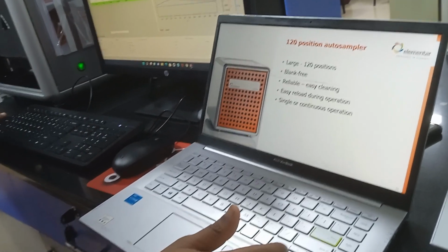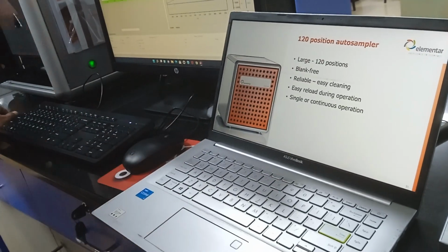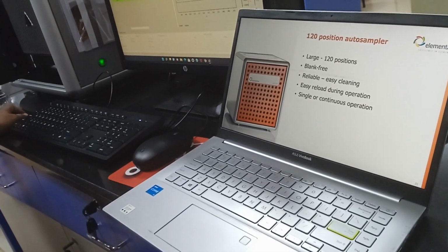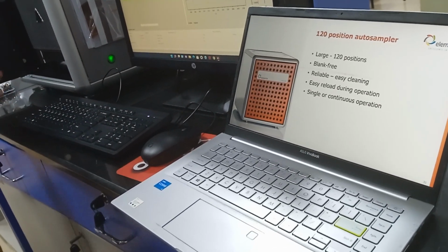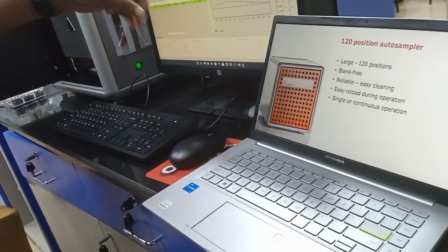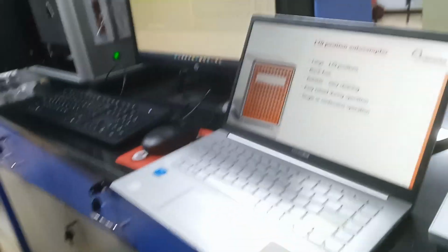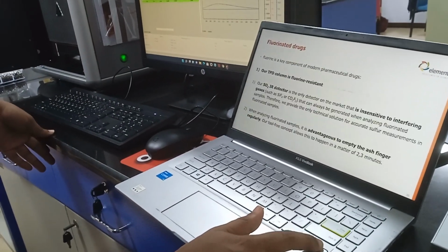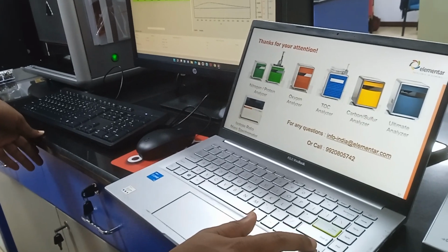It is easy, reliable, very easy to work with the software actually, single page software. There is no need to go searching for this and all. In the single screen you can find everything there.